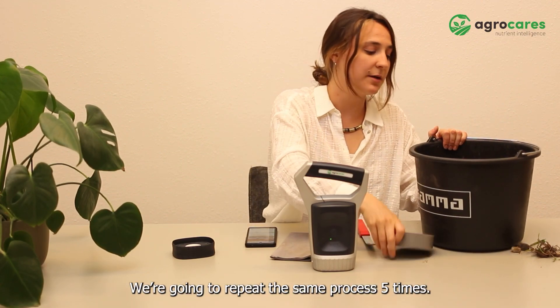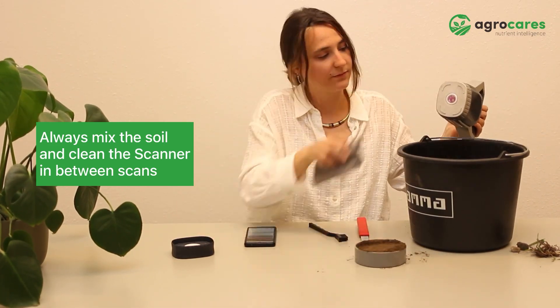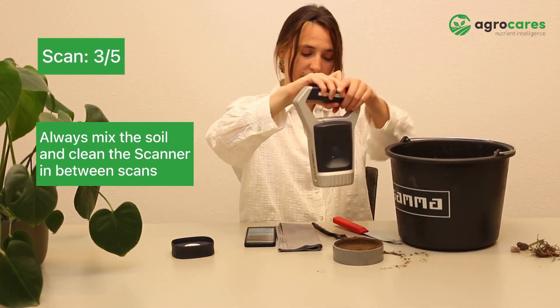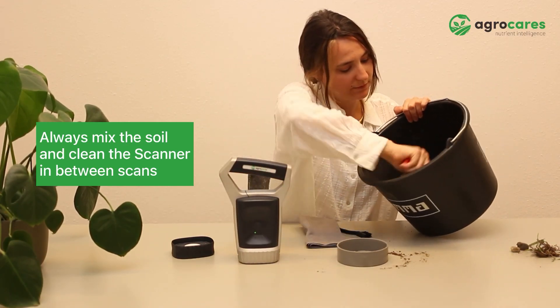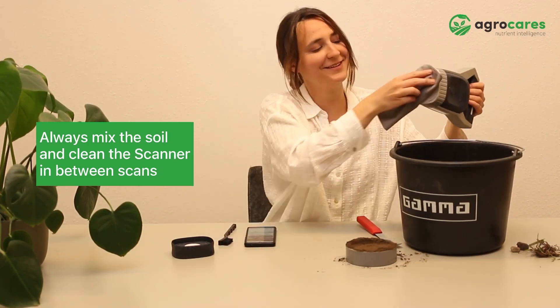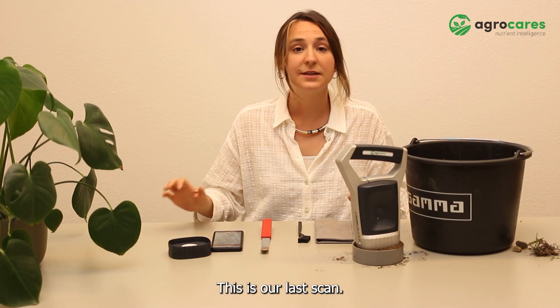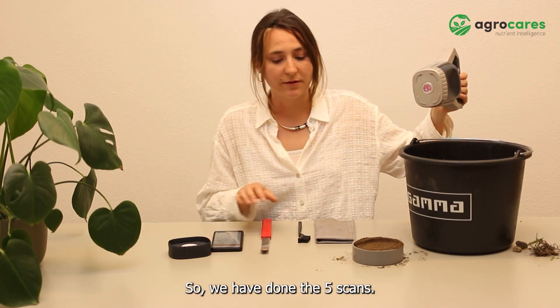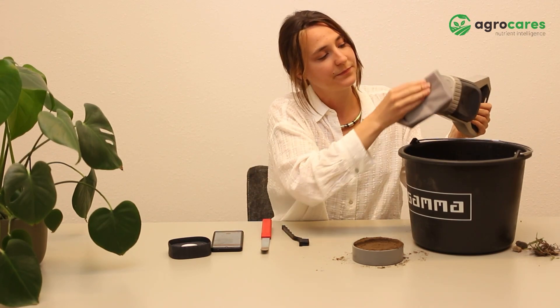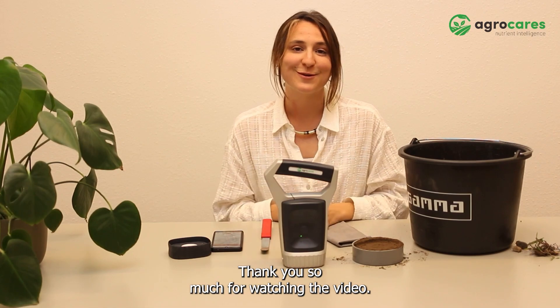We're going to repeat the same process five times. This is our last — so we have done the five scans. Never forget to always clean the scanner after use. That's it. So now you have scanned your soil sample. Thank you so much for watching the video.